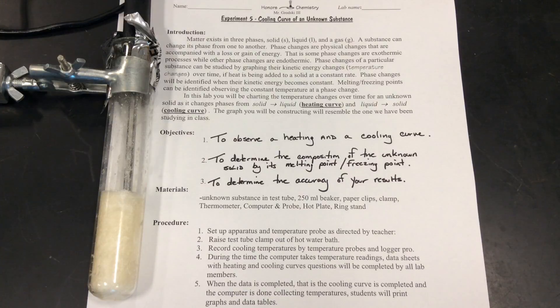As we have learned, melting points and freezing points, which by the way is the same temperature, are physical intensive properties. We're going to observe a physical change. We're not going to break any bonds here, but we're going to be able to come up with a value that will help us identify this substance, a physical intensive property.